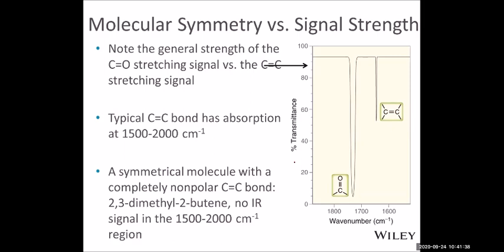So this shows you the C-O bond between the carbon and oxygen. The bond is not equally shared. Bound electrons are not equally shared. So it shows you the carbonyl C=O double bond is a polar bond, it has a stronger absorption than a symmetrical carbon-carbon bond, and that's the polarity.